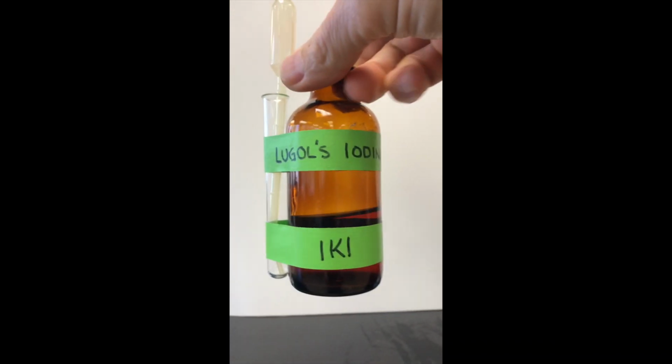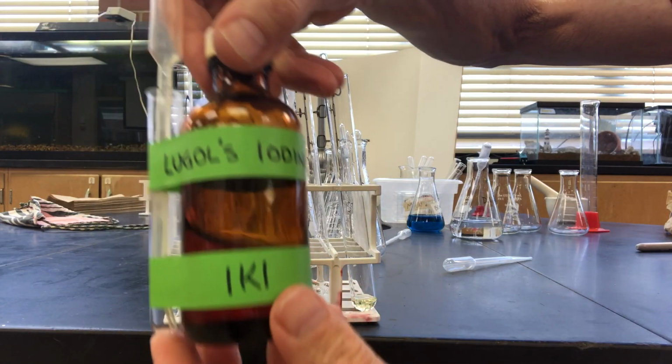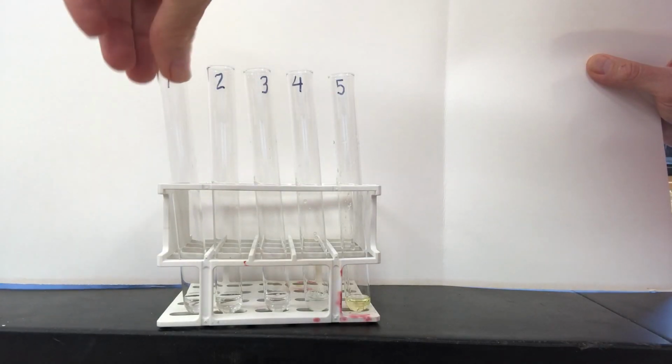The Lugol's iodine test determines the presence of complex carbohydrates or polysaccharides. The golden or coppery brown solution in the presence of polysaccharides turns a very dark blue-black color. This happens instantly at room temperature.